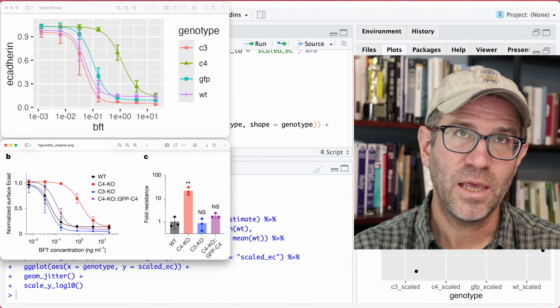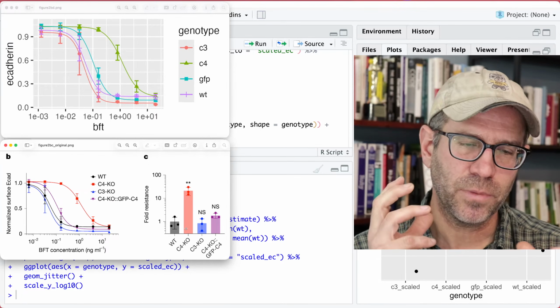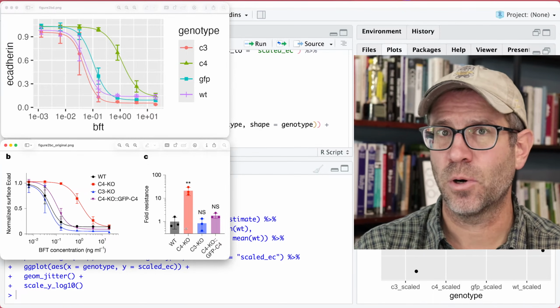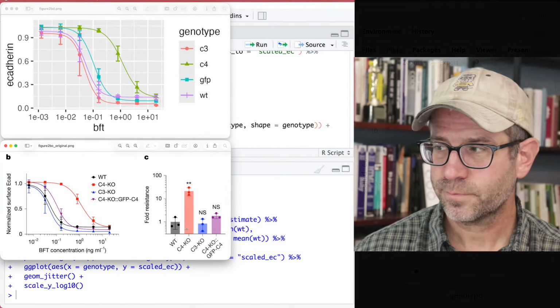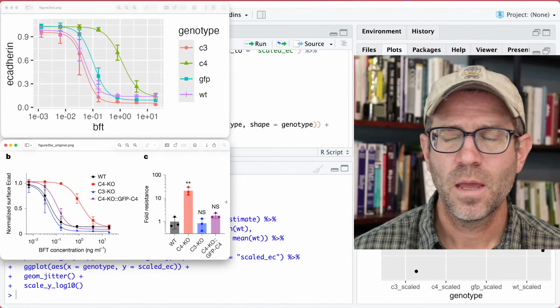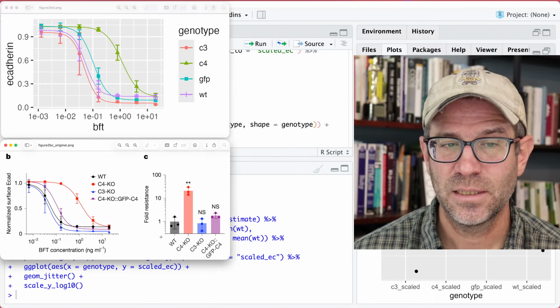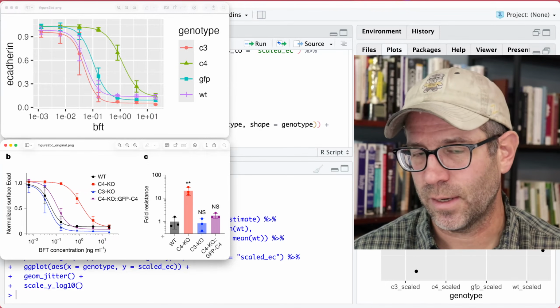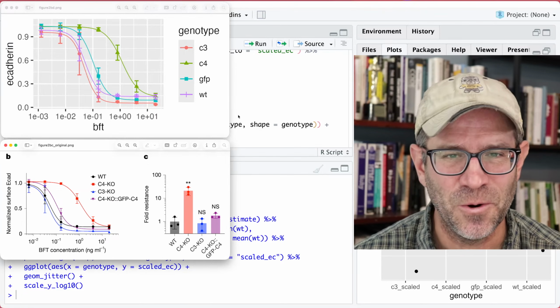And if it's not at 0, then I am going to get a skewed interpretation of the height or the area in these bars in a way that we don't when we look at the raw points, kind of like I have over here on the right. And if you then do a log 10 scale on the y-axis like this, you can't have a 0 because log 10 of 0 is negative infinity. It's undefined.